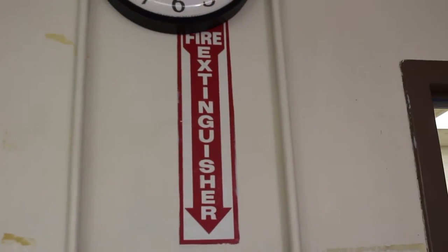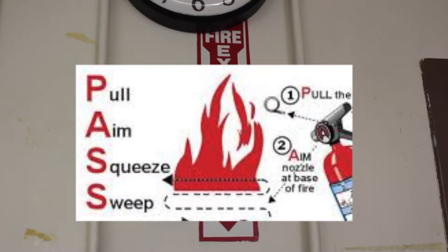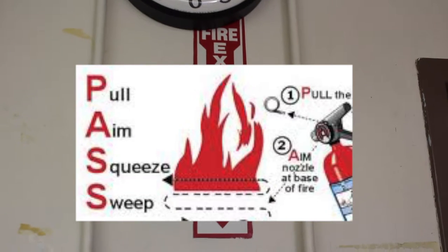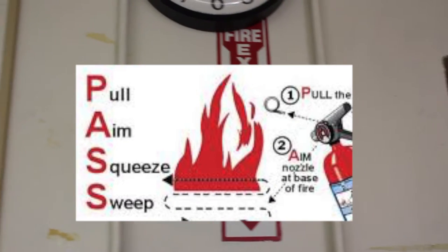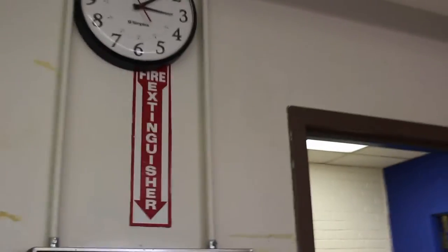Remember the handy acronym for using a fire extinguisher: PASS — Pull the clip, Aim your extinguisher at the base of the fire, Squeeze the handle, and Sweep side to side. You should also always have your back towards the door, because you don't want to find yourself with a fire between you and your exit — that's just plain dangerous.